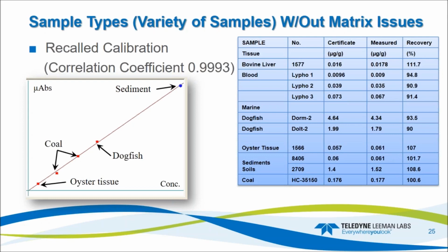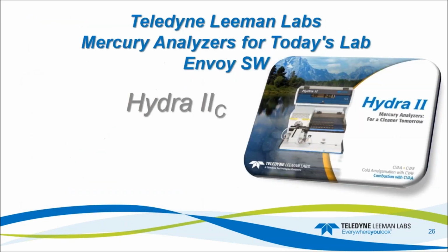And then over on the right, we have some typical samples that you may digest and run on a liquid system. If you look at the recoveries, the worst recovery is 11.7% above 100, so 111.7. This is nothing outside of the norm that you would see on recoveries for liquid samples that run through a complete digest process, and when they're compared against their certified reference values, they're usually within plus or minus of that value. So again, it looks really good. Anywhere from liver to blood to dogfish, oysters, sediments, and coal, they're all within their specified recovery limits.